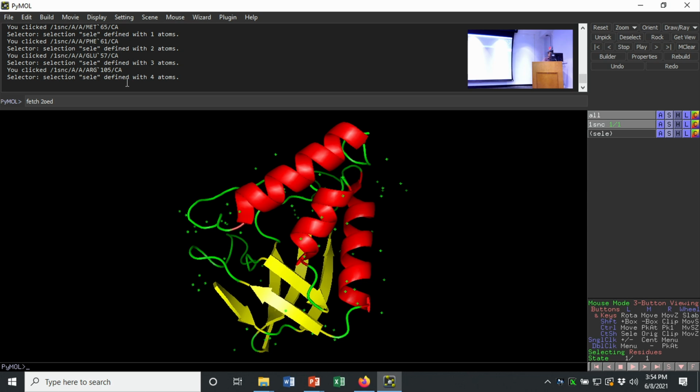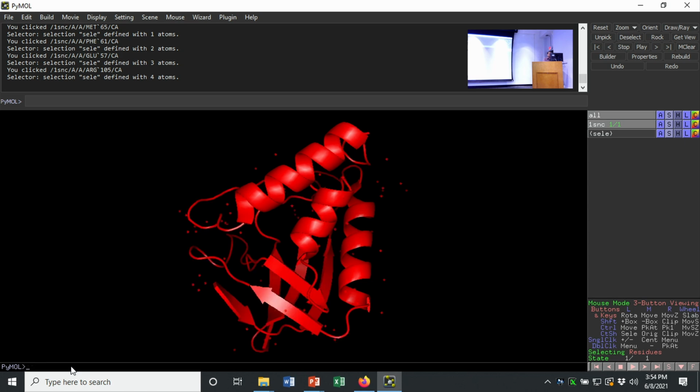And so in this case, there's a whole bunch of commands. And some of these are outlined in the PyMOL tutorial, so you'll be able to go through them and learn the commands as you go. But we'll just highlight a few of them here. The one that we can talk about that we've already seen in the mouse interface is color. So for example, if I type color red, now I color my entire molecule, or everything on the screen, red, right?